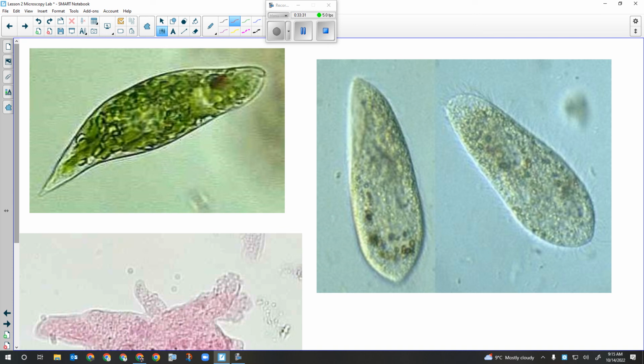The stains are different. Again, we have slides from two different manufacturers. On one of them, they'll all be the same color, kind of a bluish color. And on one of them, you're going to find some that are blue, some that are green, some that are brown, some that are purple. That's because a paramecium's color is based on what would be the equivalent of their gender. But paramecium have more than two genders, so to speak. Gender's kind of an analogy. It's not really a thing, but it's kind of like that.